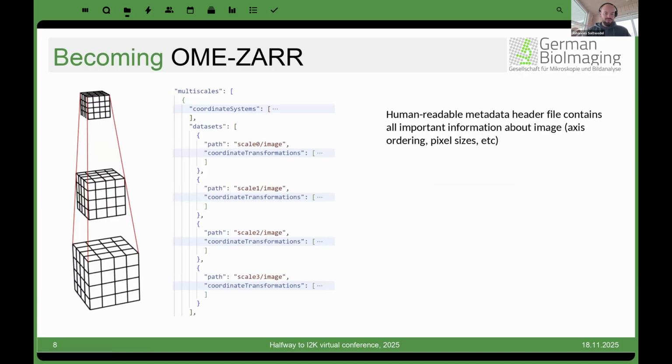And on the top level of every ome-zarr image, what you also find is a little metadata file that tells you a bit about the layout of the data. So this is really the entirety of the additional value of NGFF. Some people sat down and actually wrote down how this stuff should be structured and how it should be read.